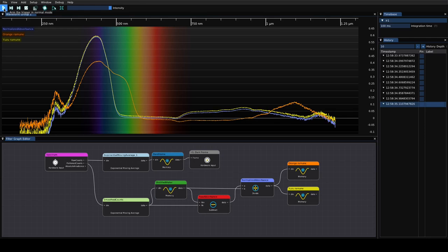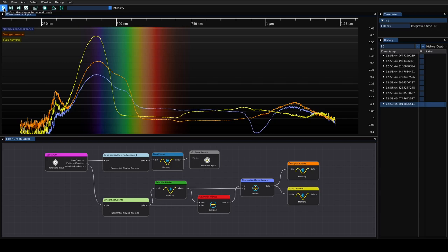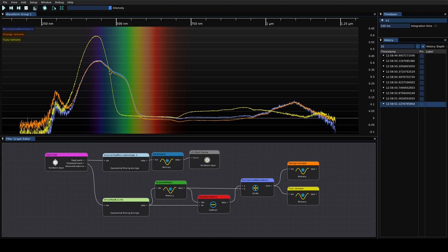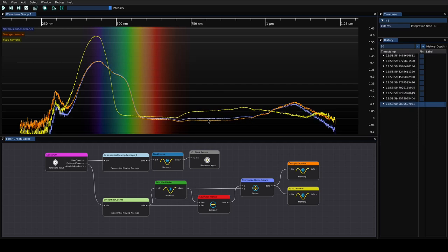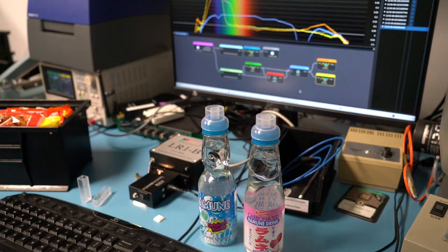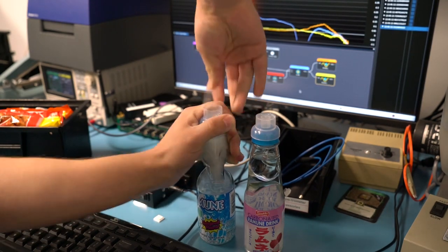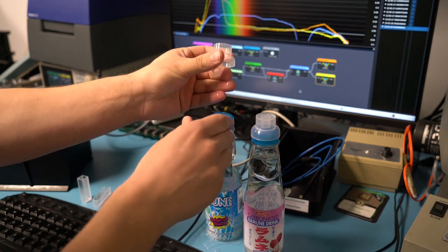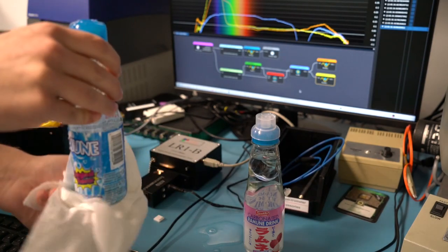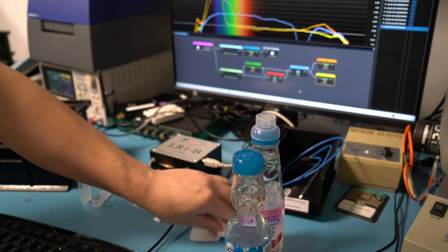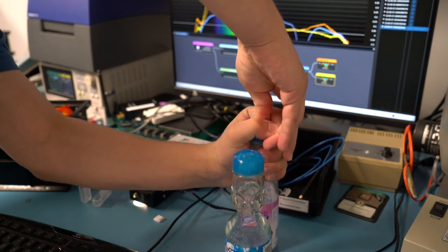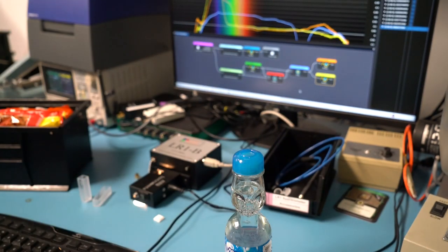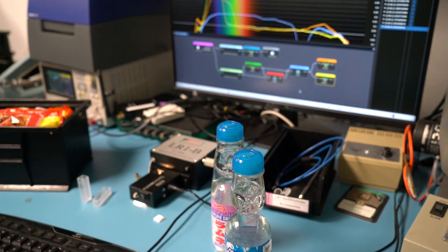Let's just color this spectrum so it looks like the sample so we can remember what's what a little more easily. Yeah, it looks to have stabilized pretty good. So we're going to say that the Yuzu is probably a fine spectrum. And then we'll just put back the orange one and make sure we get something that looks a lot like our original curve. We can see pretty distinctly the spectrum looks just about what we had before. There's a little bit of a delta, so I don't know if our normalization was a little off or if we still had some bubbles there. No, it's converging, so this is pretty good.